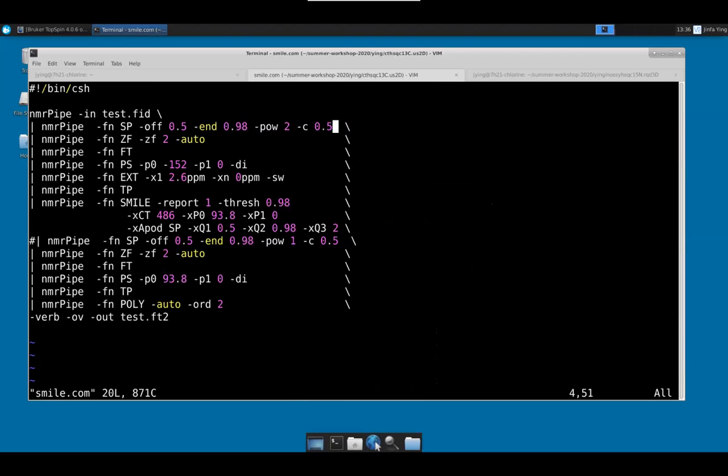Yeah, it doesn't work that way. I'm sorry. Direct dimension, we assume that a good spectroscopist should always optimize the direct dimension. And my practice is that you always acquire longer than you need. It doesn't hurt you anything, you just end up with a bigger data processing.